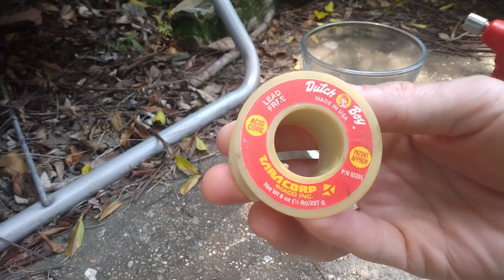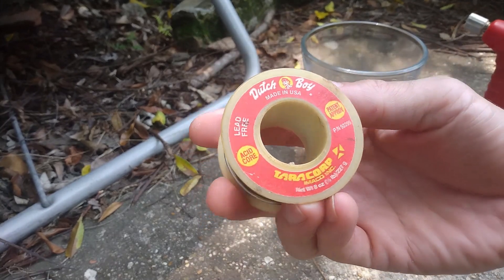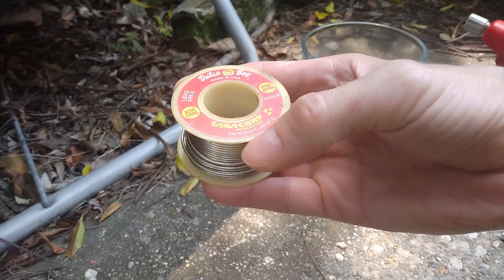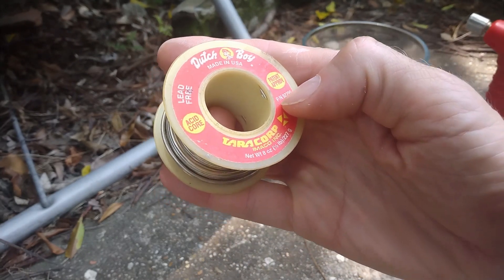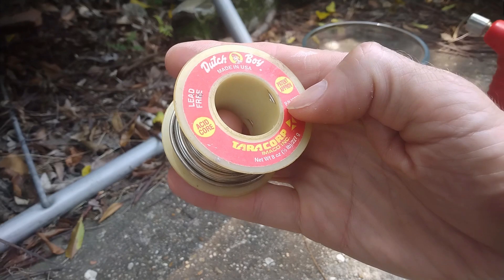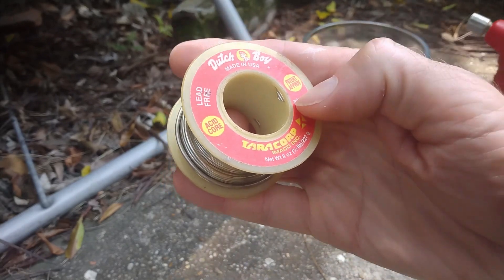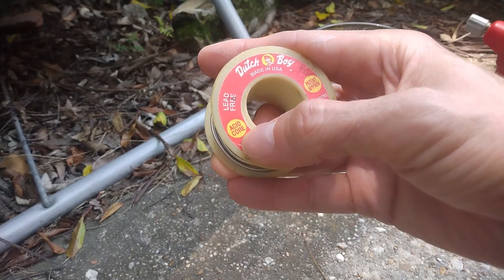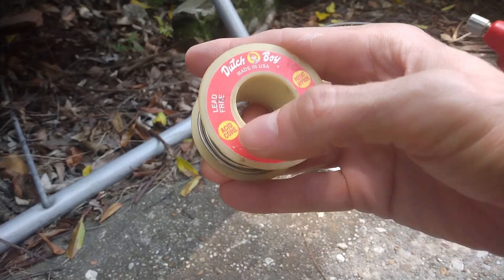Here is the solder I'm using. It is important to make sure that it is lead-free and also that it doesn't contain any silver. There is nothing about the ingredients mentioned on the packaging, so I looked online for the same reference number and found that it is made of 95% tin and 5% antimony. Antimony is perfectly fine because it won't react with the hydrochloric acid, so we can filter it out once the acid has dissolved the tin. Also, this one has an acid core, but that's not a problem because I'm going to boil it away.